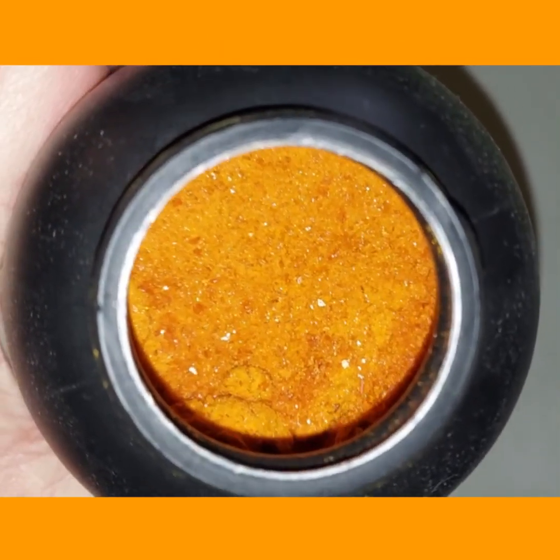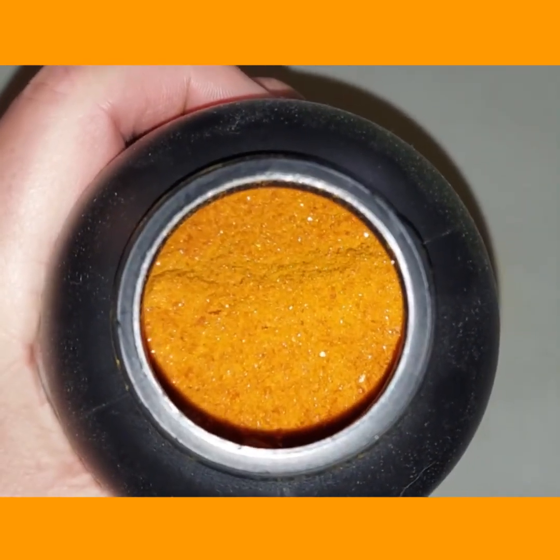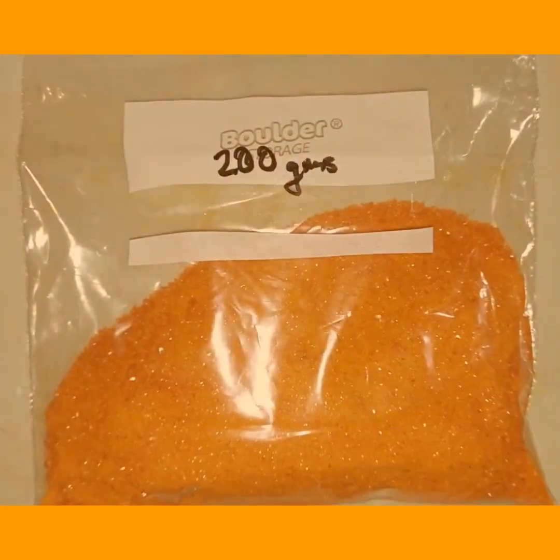Here's the ammonium dichromate — you can see it's got crystals, some of them are slightly different colored than others, mostly just orange. We'll be putting this in a pile and lighting it on fire. Here I have 200 grams.